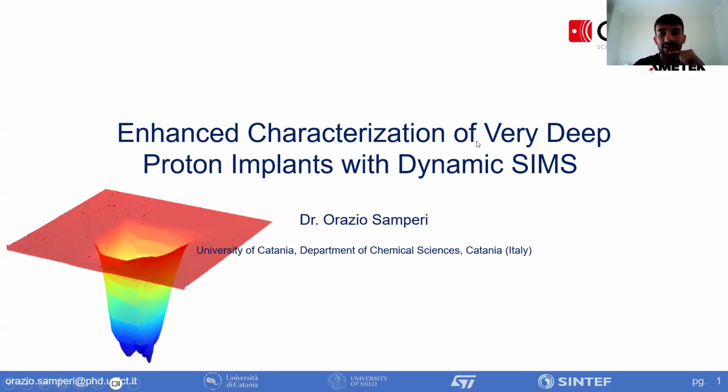Today we will discuss the results of my latest paper about the characterization of deep proton implants in silicon. It's not written here in the title. Deep proton implants in silicon are characterized by dynamic SIMS. Then I will show basically some collection of depth profiles of hydrogen implanted silicon.